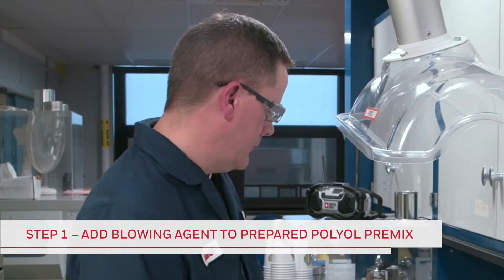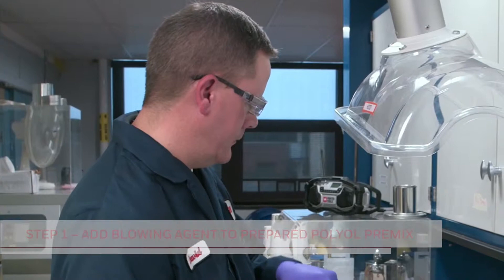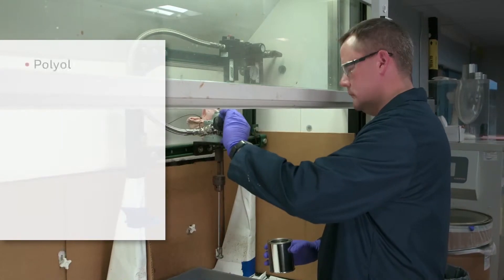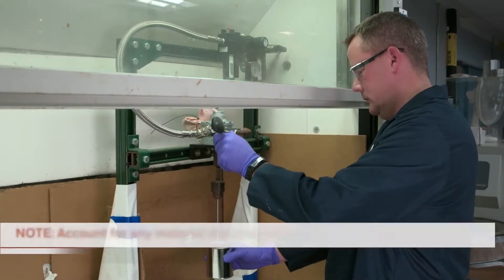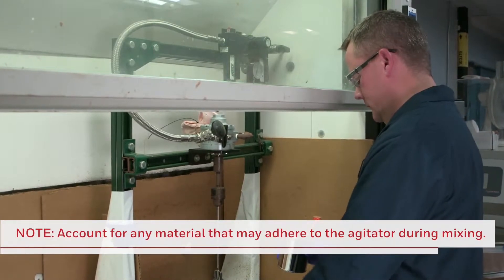A polyol premix is prepared by weighing out the necessary components into a polyol blend vessel, and mixing thoroughly after each chemical is added. The components are added in the following order: polyol, surfactant, flame retardant if applicable, catalyst, and water. Be sure to account for any material that may adhere to the agitator during the mixing process.